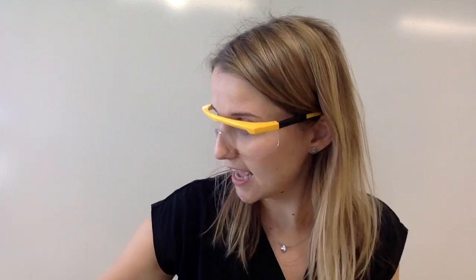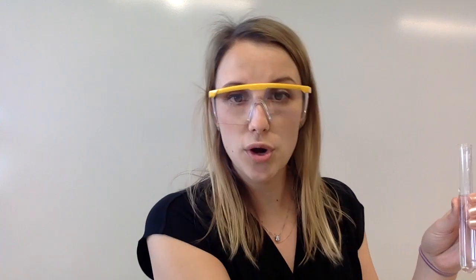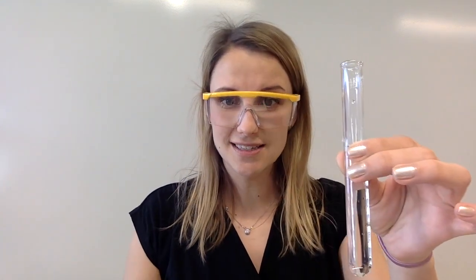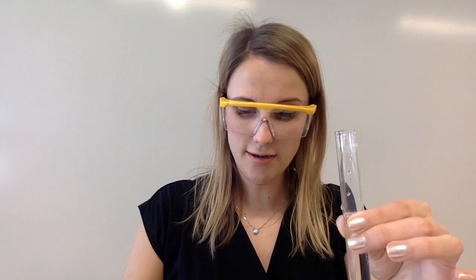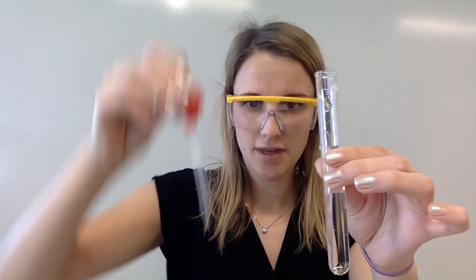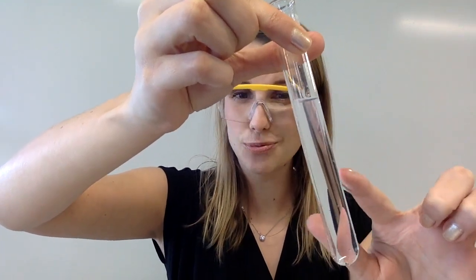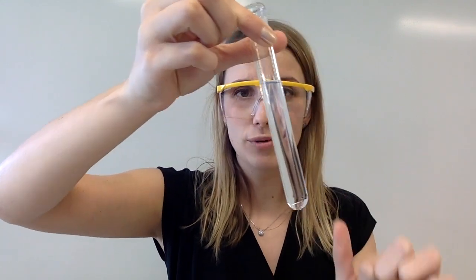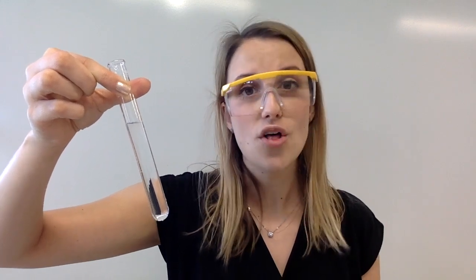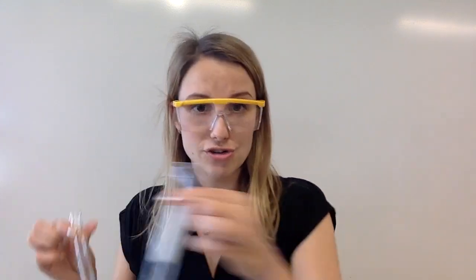Now, if I test calcium 2+ ions, a different sample now, with ammonia, then you get something slightly different. So with the ammonia, calcium, you can see, kind of almost gives like no precipitate or a very, very light white precipitate, but you don't really see a lot. It's definitely not as white as the calcium with the sodium hydroxide that we had 2 seconds ago. So let's check out the equations to represent both of the reactions that are happening here.